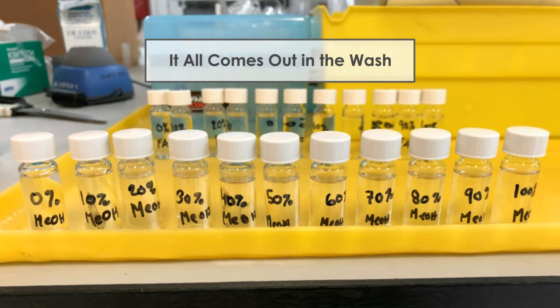And we went through all the different things. So you basically follow the method up until the wash step, and then I would recommend doing this with neat standards first, not in matrix, assessing the recovery that you get, treating these like an elution solvent, and then seeing what you get for 0% all the way up to 100%. And this is what we got, actually.